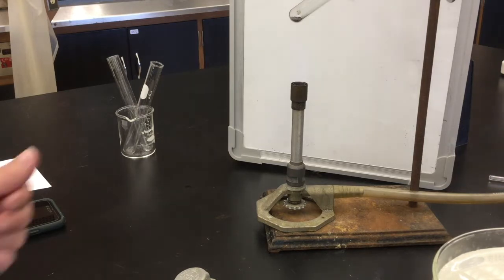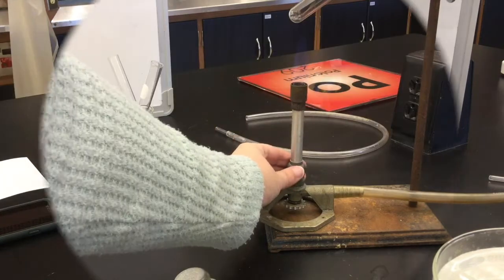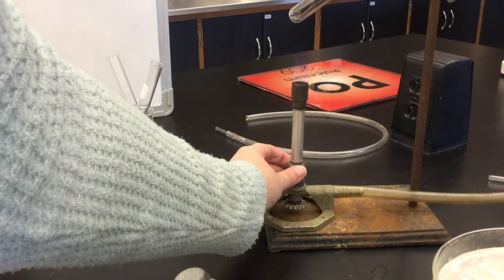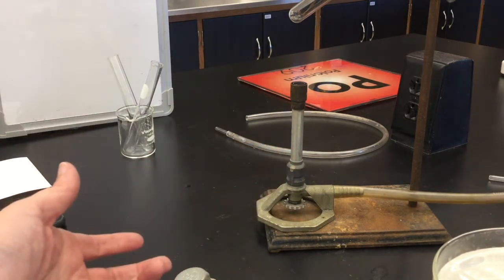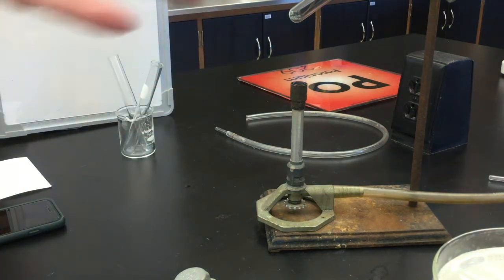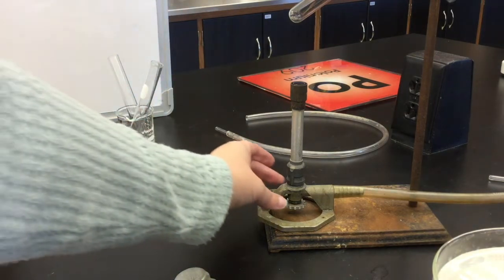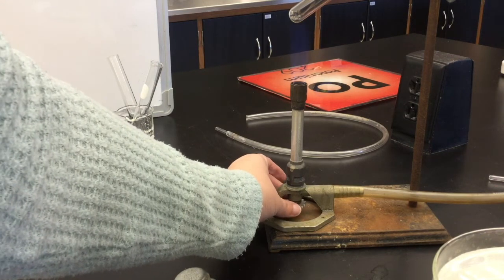To adjust the flame to a higher temperature setting, you are going to need to add more oxygen. You will do this by moving the barrel at the bottom. So you are going to turn this to the left to open it up. You will see little flashes of yellow or orange. That comes from the salts that have been deposited on the top of the burner through various means, and from the iron that is in there. You will probably need to turn up the gas as well.